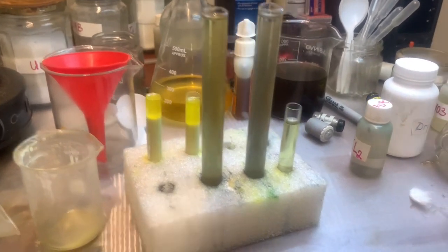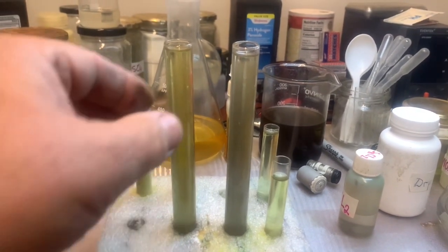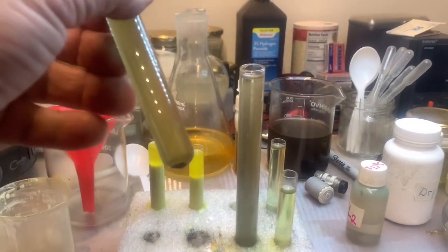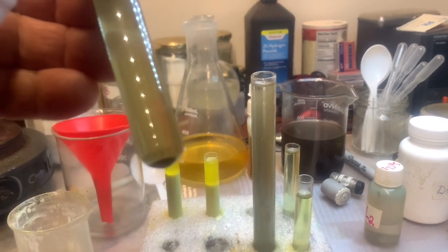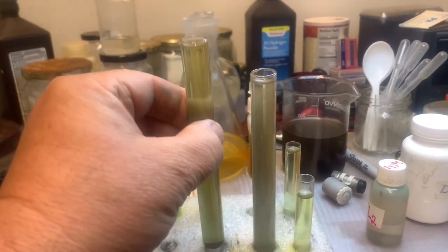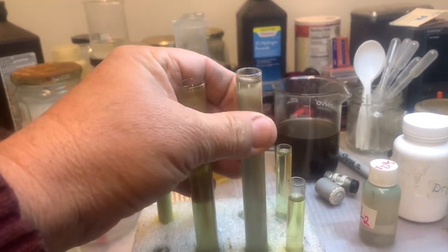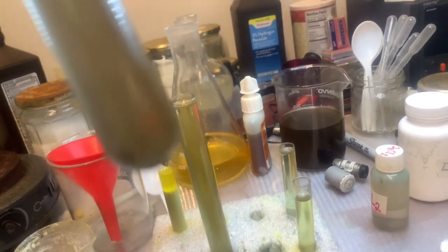So I wish you liked it. You saw how to get that gold. And when you have a lot of solution, you just put in stannous chloride, precipitate, make colloidal gold, and then redissolve. And that way you get gold. If you look at this gold in a microscope, it's at the bottom, it's a very nice picture where you see microscopic pieces of shiny gold.